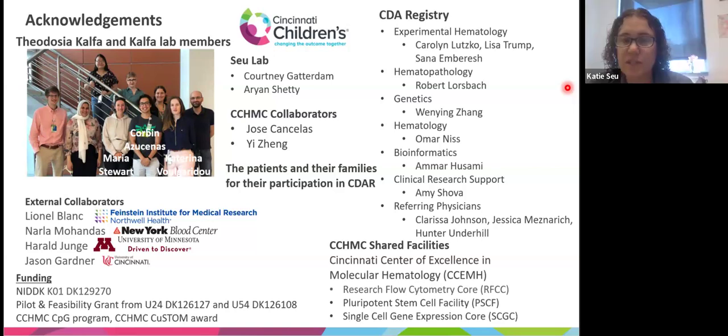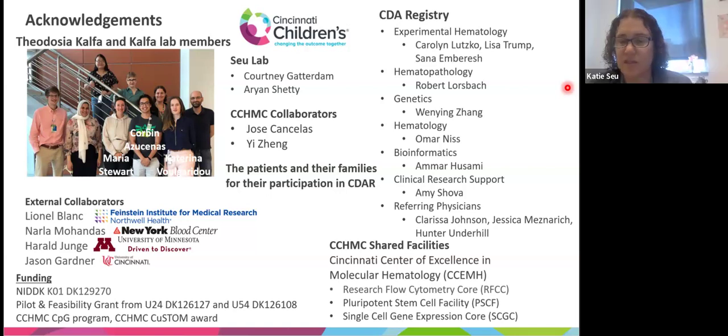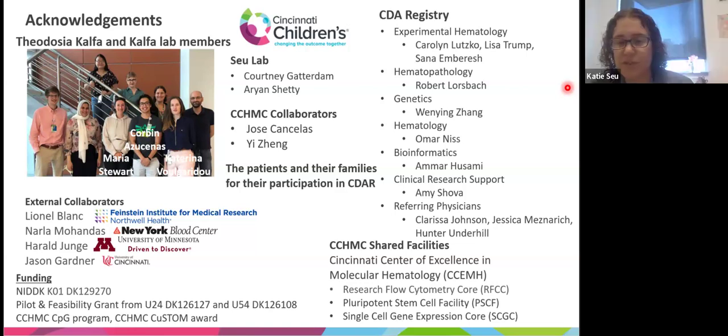In the spleen, we don't usually see erythroblastic islands at baseline. There's not usually any islands at baseline, which I guess is not surprising, but also interesting since you have the red pulp macrophages there and they're doing their job, eating the red cells, but they're not supporting erythropoiesis, maybe because the stress progenitors aren't there. But yes, we don't see islands at baseline, just under stress.